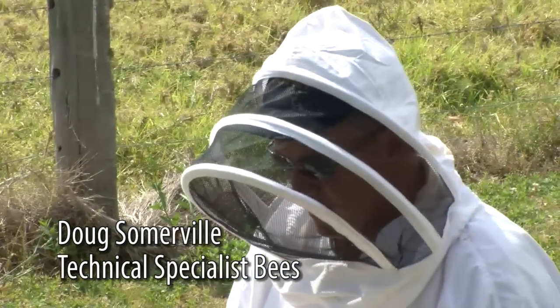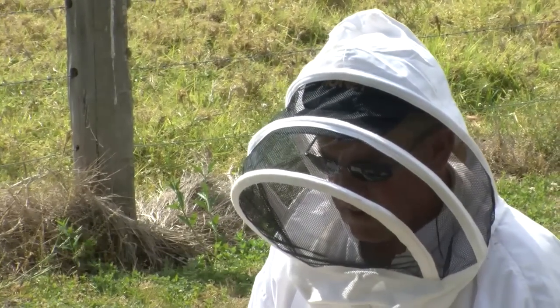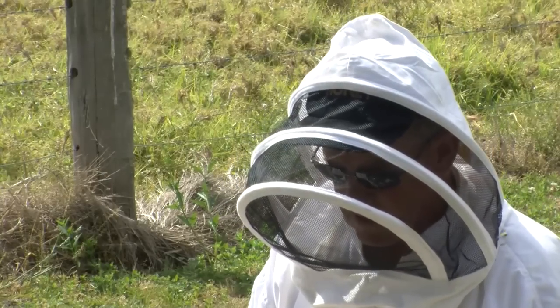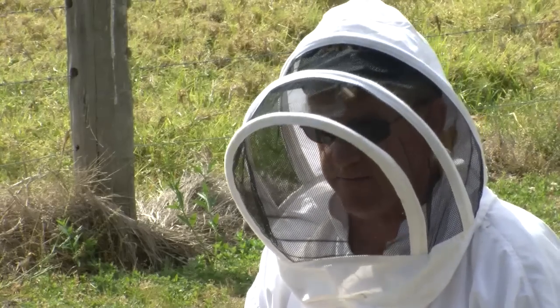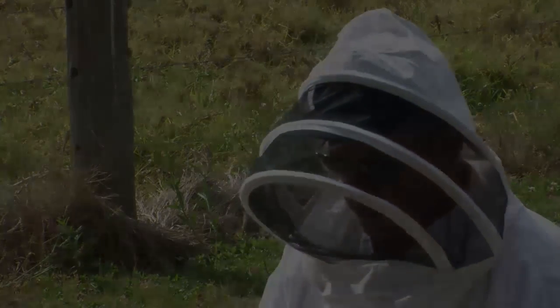What I wanted to demonstrate is a technique for measuring the varroa mite levels within a beehive. It can also double up as an excellent surveillance technique to determine if a hive has an infestation of varroa mites. It's called a sugar shake.